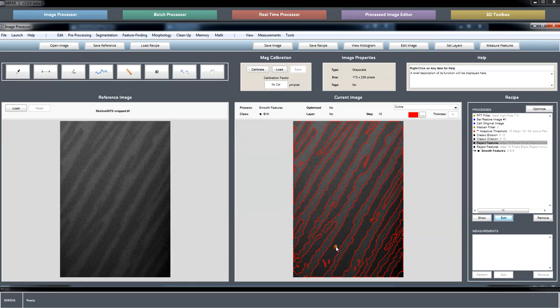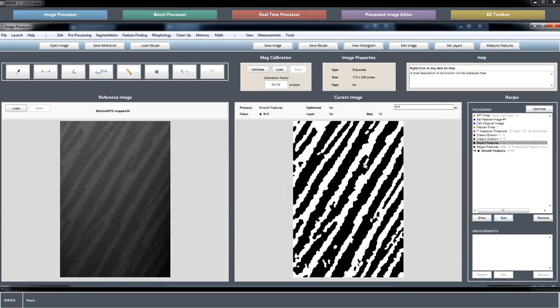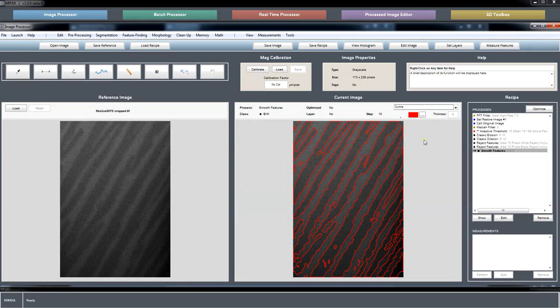Instead of just looking at them on the basis of 2D area size, you're considering their 3D thickness, and it then should be obvious what small features should stay and what need to go. So that's one example of noisy data, and the kind of segmentation we were able to get.